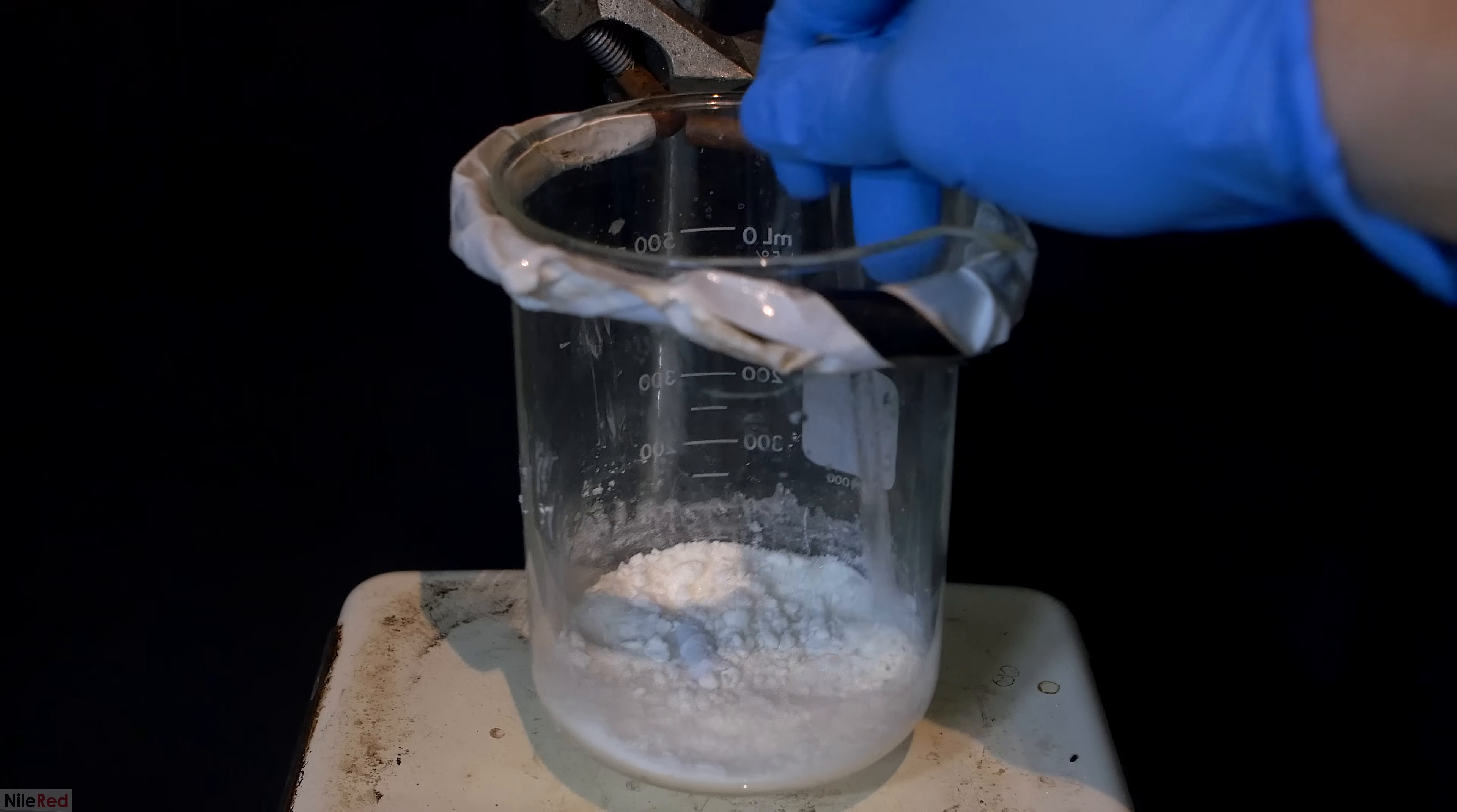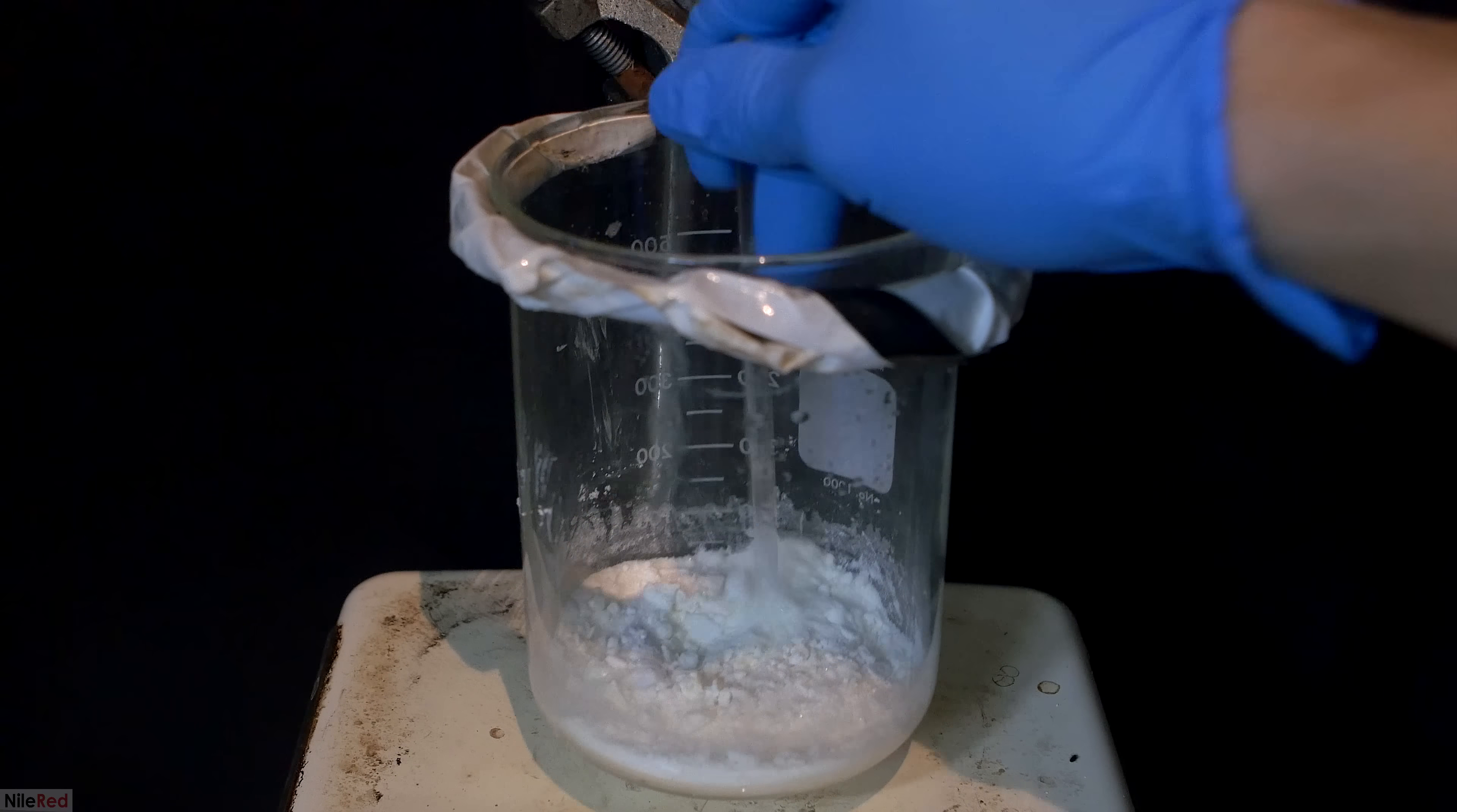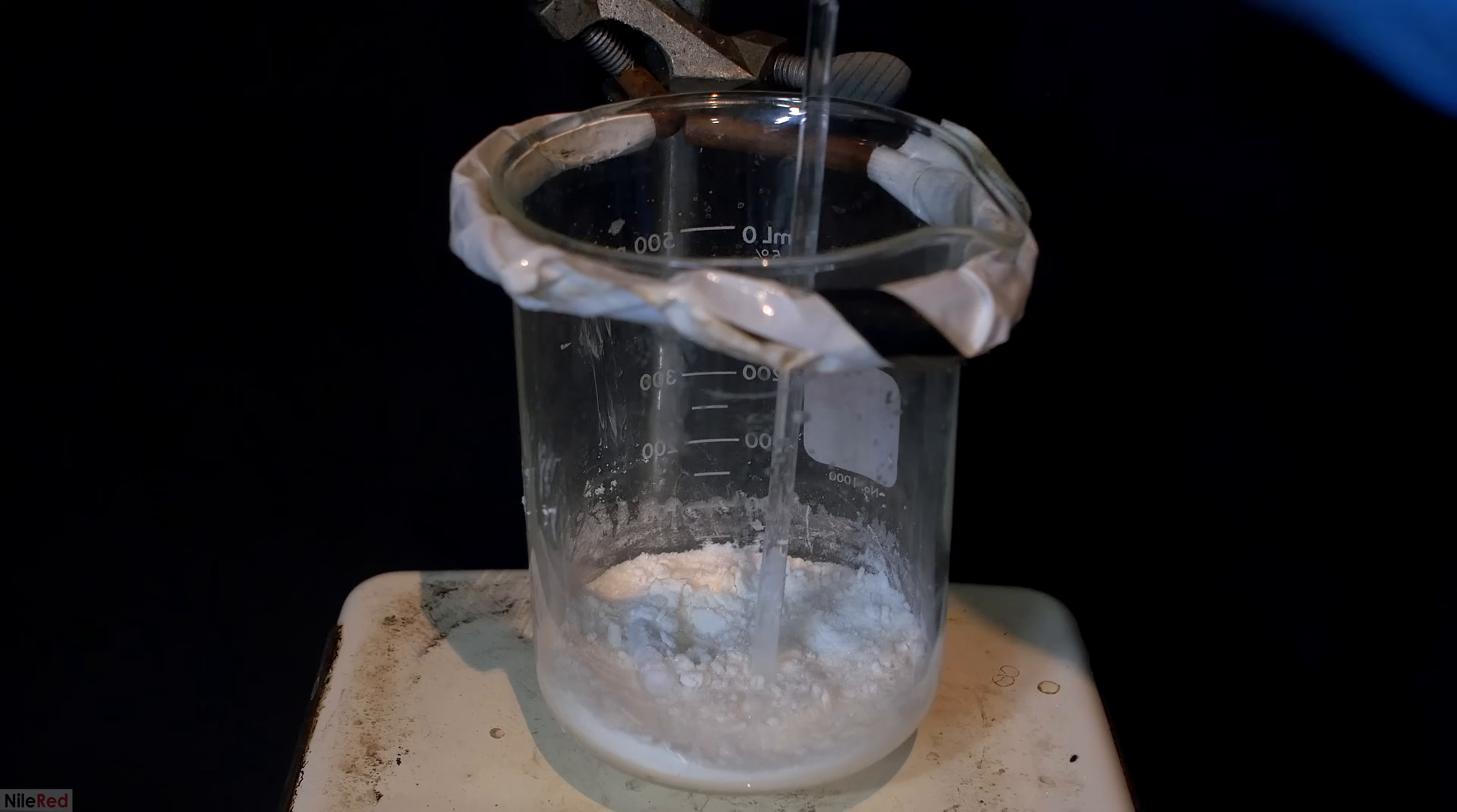Anyway, with that warning in place, we can move on to the introduction. Mercuric chloride, or mercury(II) chloride, is an extremely toxic, colorless, and odorless salt of mercury.